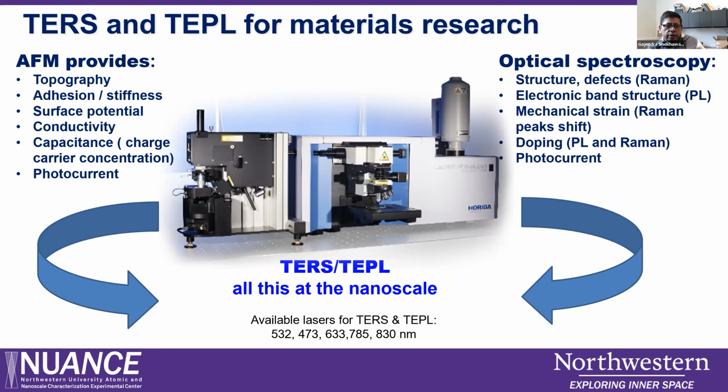If you look at the different AFM capabilities within this configuration, they provide topography, stiffness, or mechanical properties. You can do surface potential, capacitance measurements. Basically, you can do carrier concentration. You can do photocurrent measurements. So it's a fully loaded AFM with all functional capabilities.